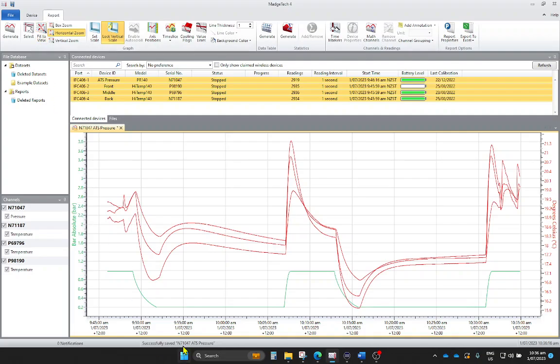So what I want to do is interrogate this vacuum test here and see how much leakage we actually had on the machine. So what we want to do is turn time slice on. So if we come up here to the ribbon bar, we've got this one called time slice, and we want to enable it. And you'll see here now we've got this blue bar, and what if we hover over it, just a tip for young players, always come back to your select button, otherwise it's going to try and zoom if you don't quite get on there.